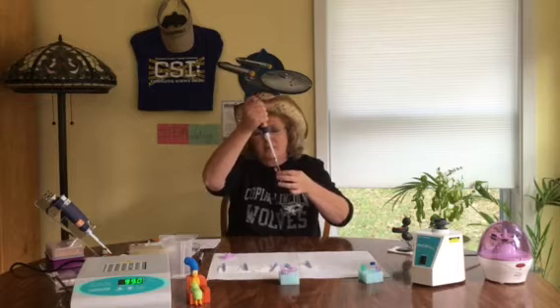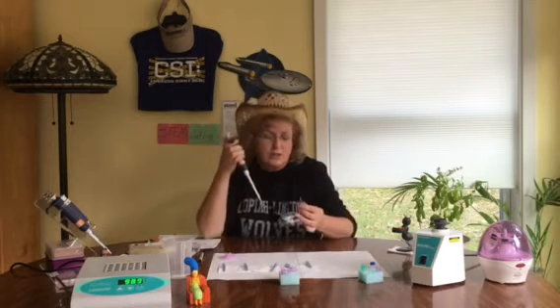Now remember, the purpose of the Instagene was to chelate the magnesium ions, because once the cell and the nuclear membranes are ruptured, DNases, enzymes that will cut up your DNA, may come in contact with it, but they can't do it if they don't have their little helper, the cofactor magnesium ion. So we're going into different tubes, so pop the tip because you'll have different insects. You don't want to contaminate anything.